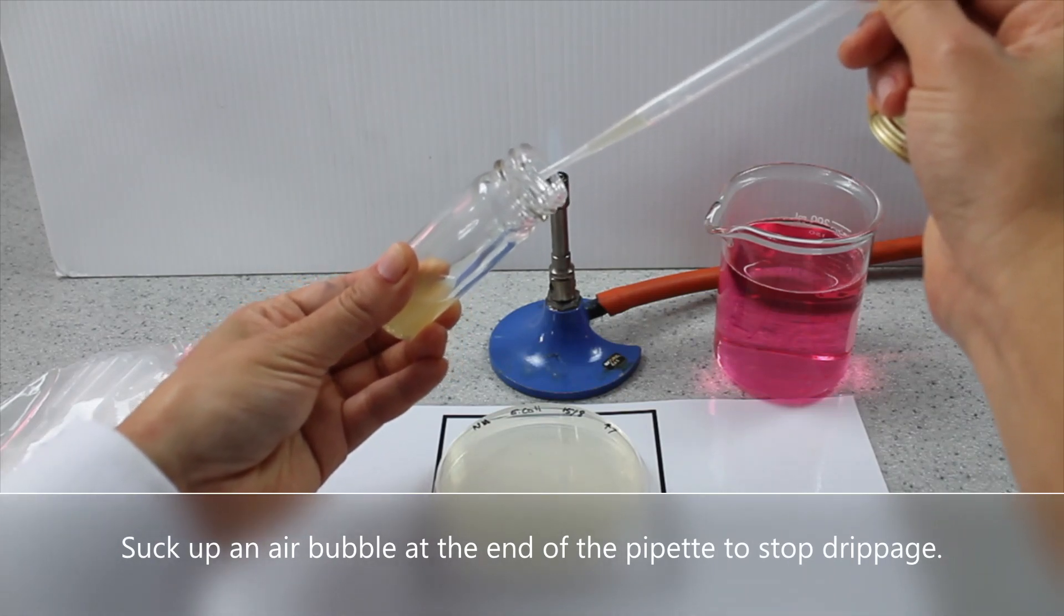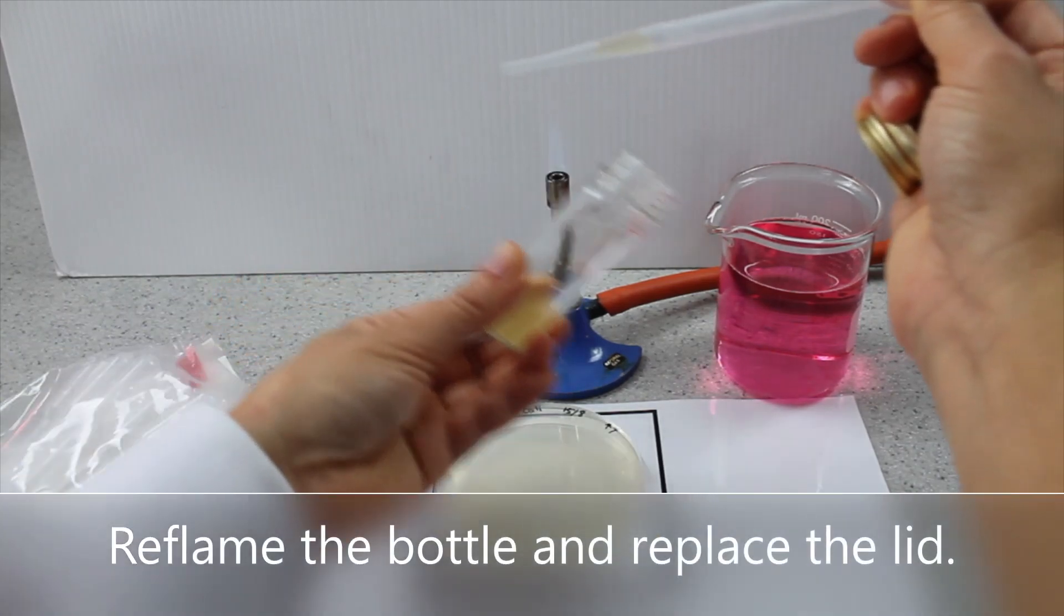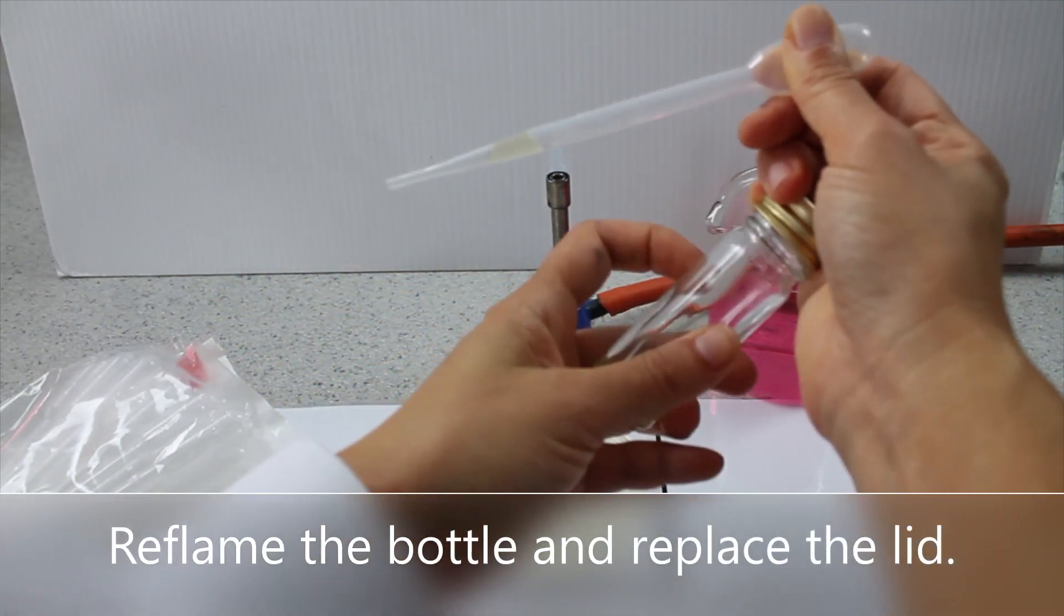Suck up an air bubble at the end of the pipette to stop drippages. Re-flame the bottle and replace the lid.